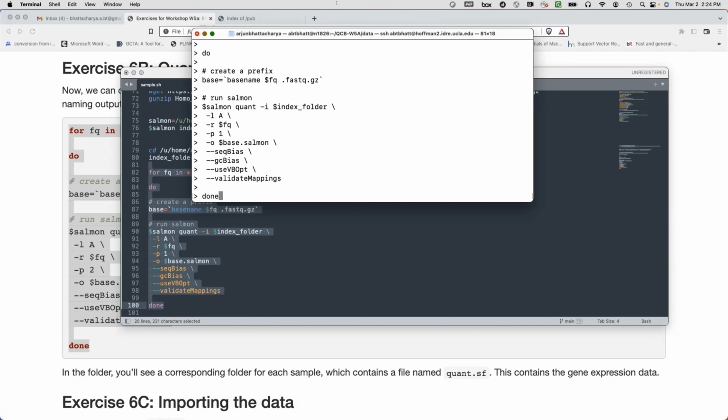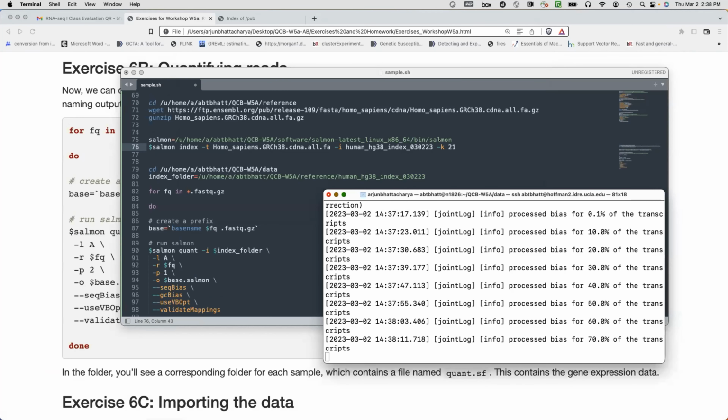For those smaller experiments, you could use some of the techniques we talked about yesterday. Yeah, I personally continue to use Salmon even for smaller experiments, because at the end of the day we're using similar annotations. So the transcripts that we quantify, or the exons that we quantify, are represented similarly in both settings.